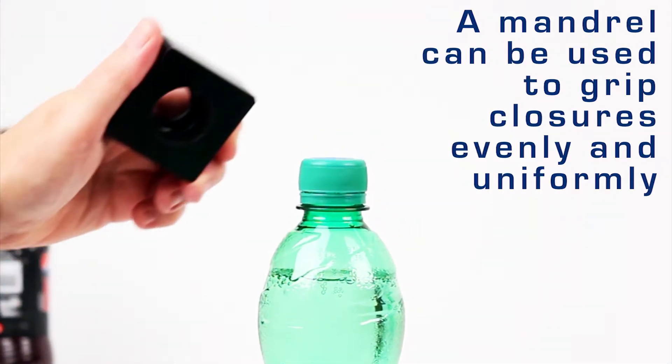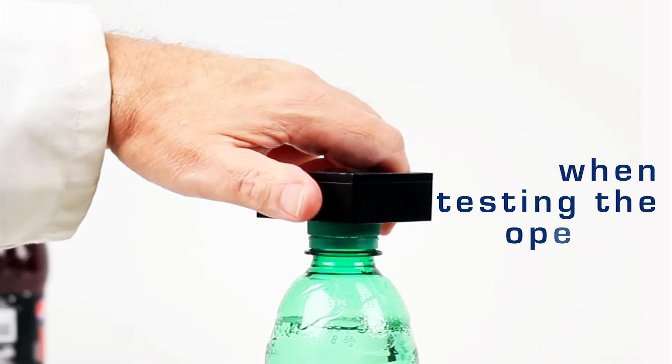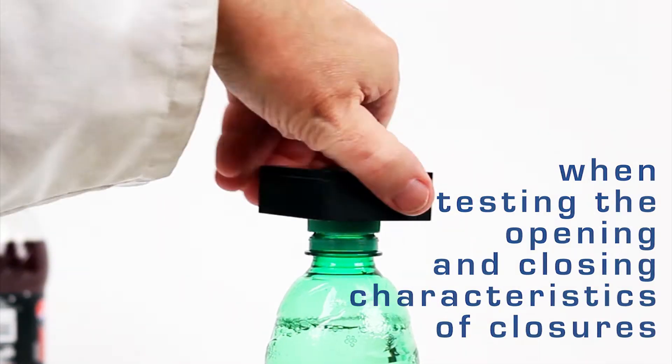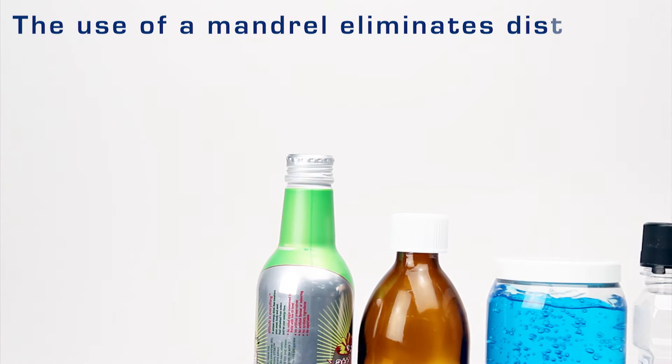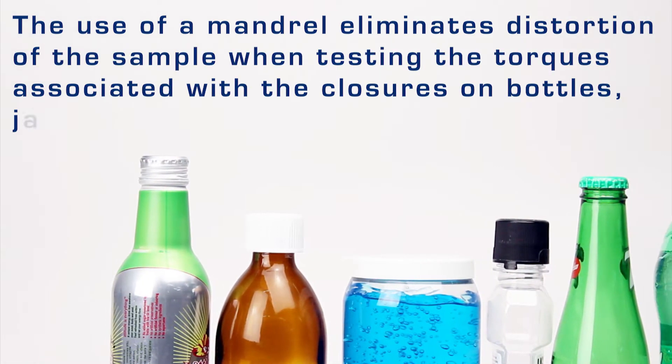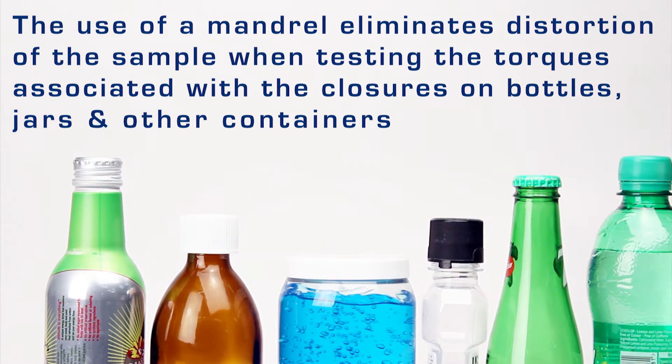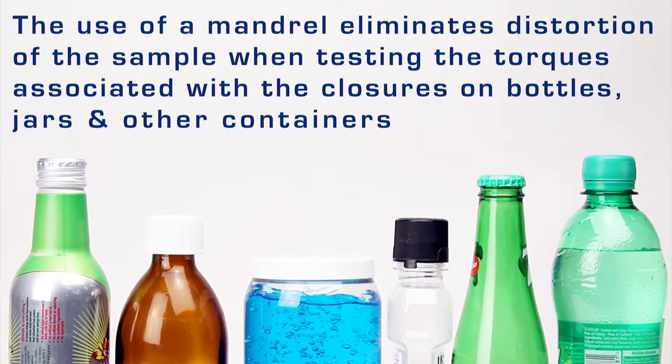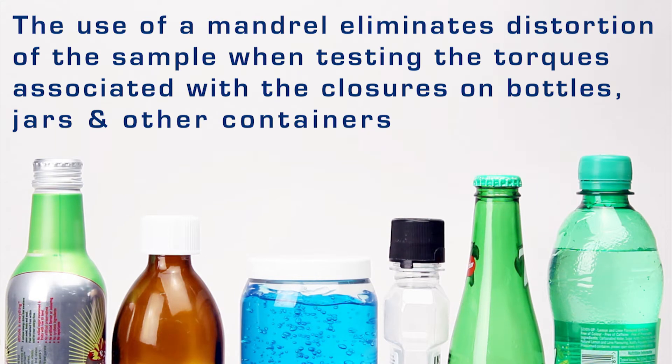To grip closures evenly and uniformly when testing the opening and closing characteristics of closures, we can use a mandrel. Because the mandrel is designed specifically for each closure, it also eliminates the distortion of the sample when testing the torques associated with the closures on bottles, jars, and other containers.